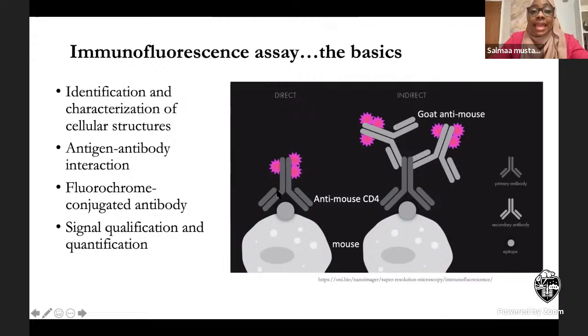So you're gonna get a primary antibody that's fluorochrome conjugated and recognizes CD4. If you're trying to look for antibodies, you wanna go online and look for anti-mouse CD4, because you're working with a mouse, okay? So you're gonna look for an antibody that reacts with the CD4 antigen in a mouse. And with this step, you're done.